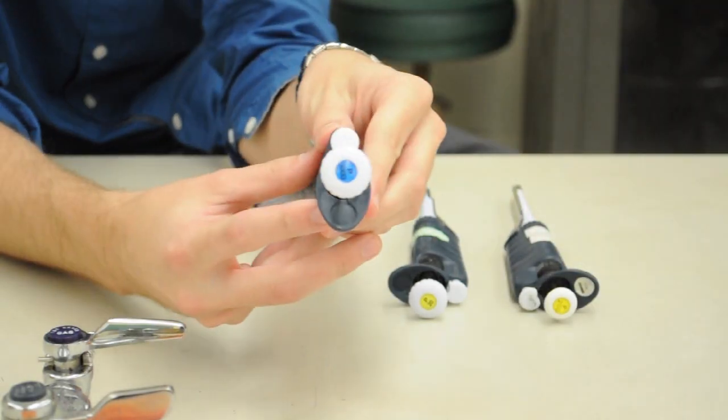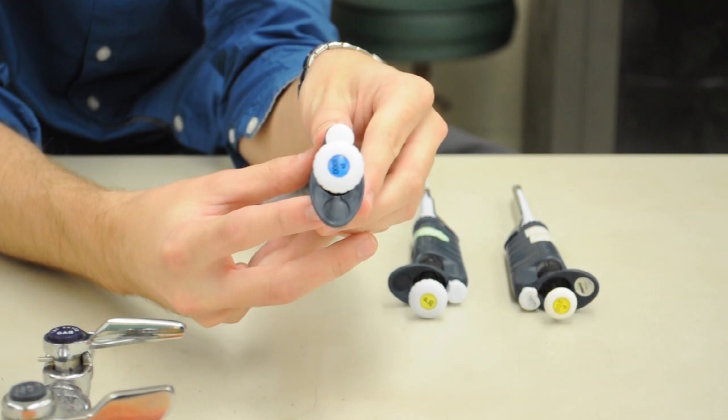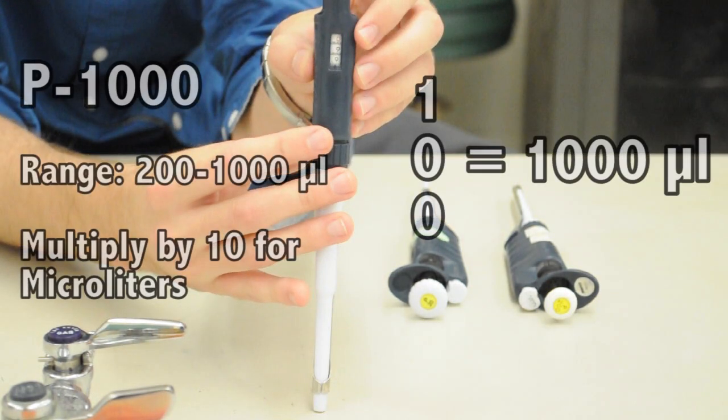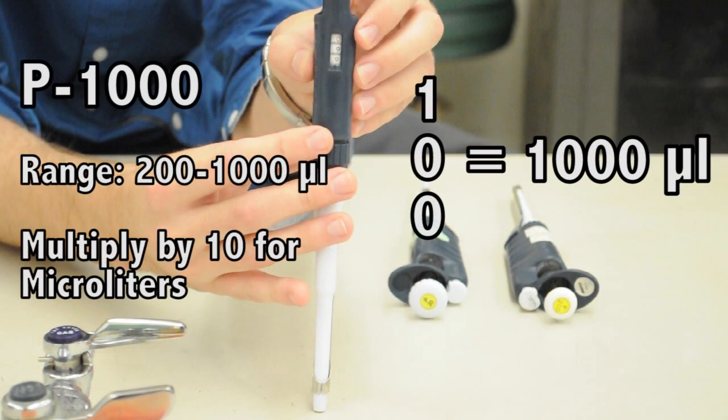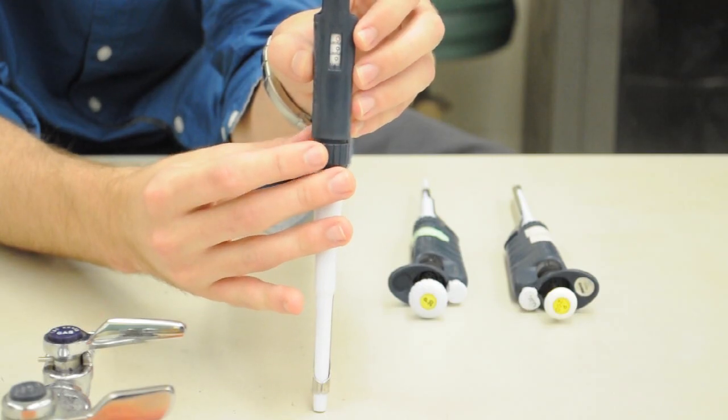For the P1000, the effective range is 200 to 1000 microliters. And you'll multiply the 3 digit number you see by 10 in order to get the number of microliters that you'll be working with.